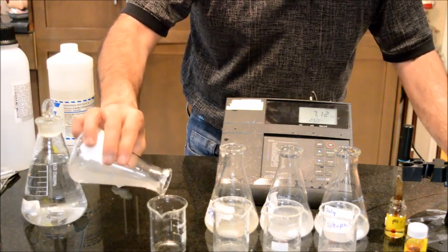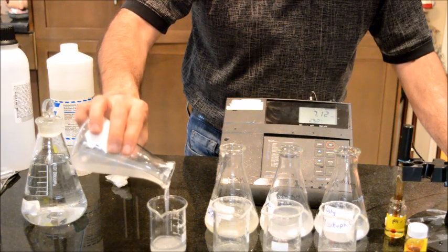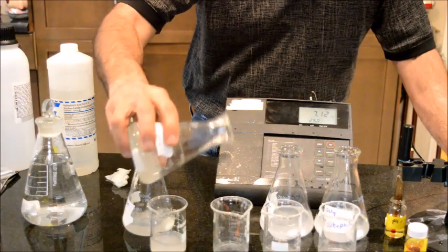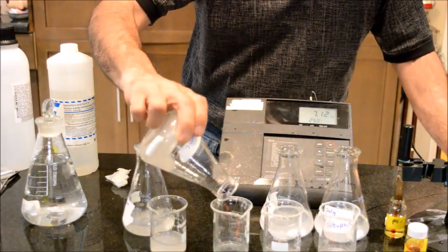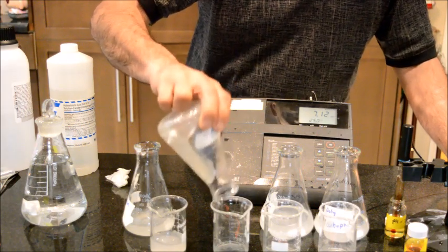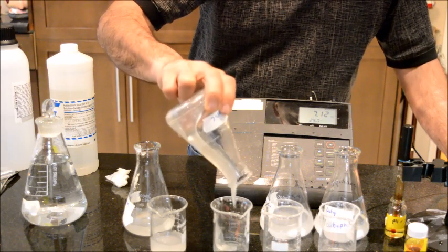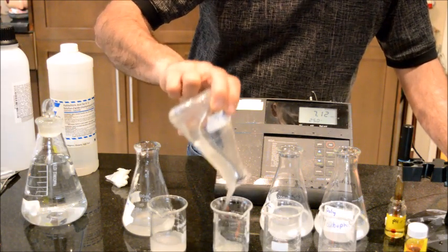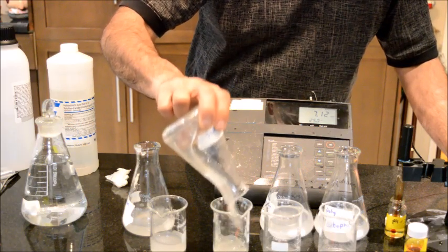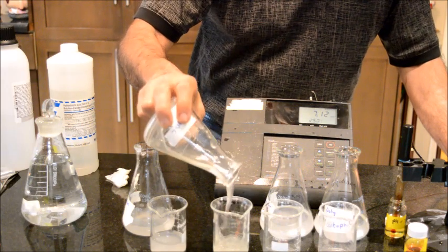So this is the viscosity of Xanthan gum 2% solution as is, without any pH adjustment. This is the sodium alginate high viscosity. It is quite viscous and it is hard to transfer even. Alginic acid itself, if you want to prepare it, actually it is very liquidy and it doesn't want to dissolve. And when the pH is adjusted to neutral, the sodium alginate tends to have increased viscosity.